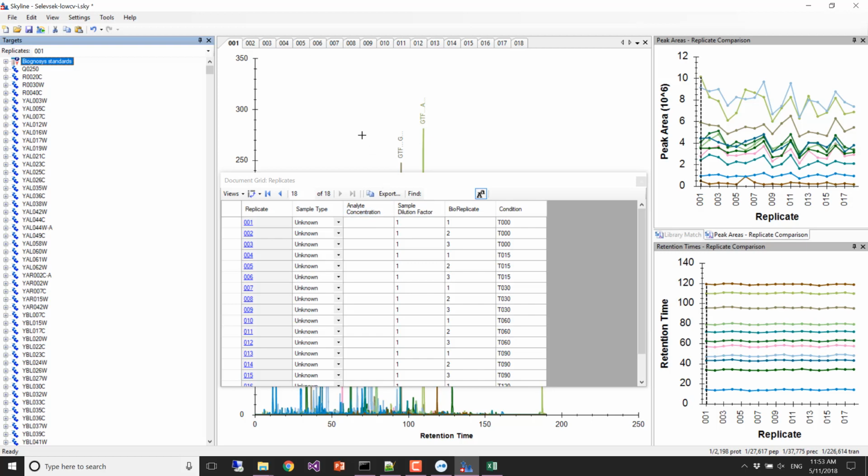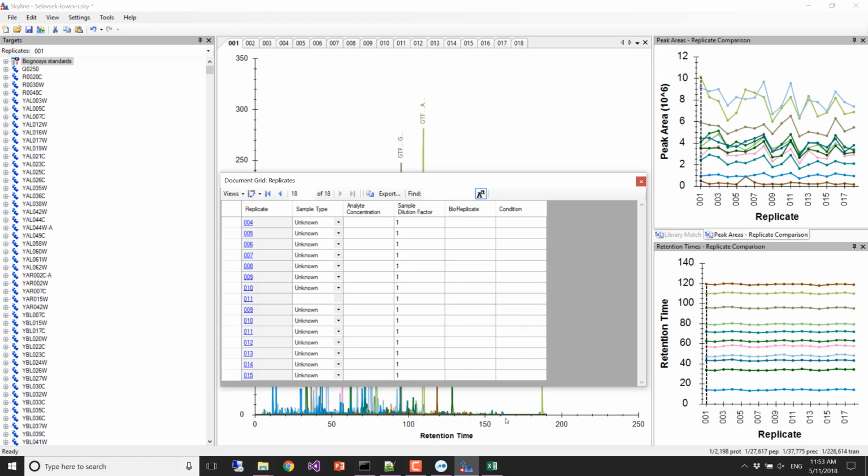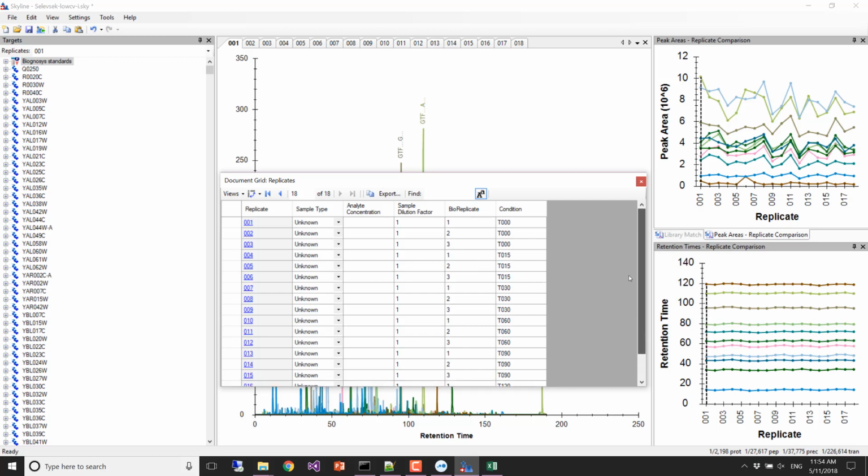What? Yeah, it's a spreadsheet. You want to delete everything out. Just select it all and press delete. Oh, delete. Yeah. Backspace. Yeah, it's like a text editing command. So do people have that?